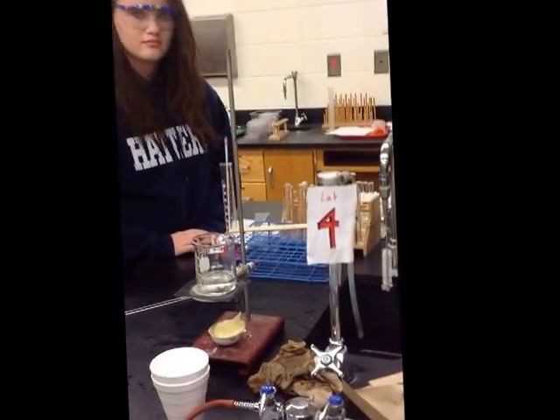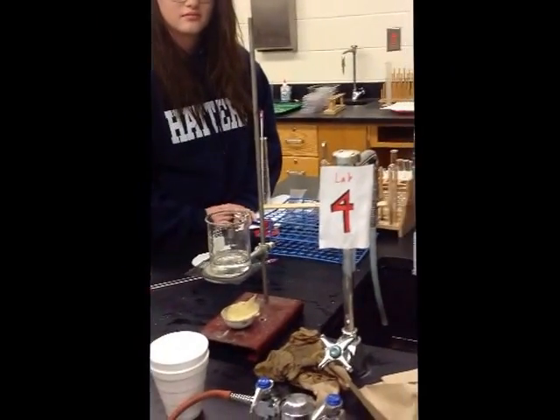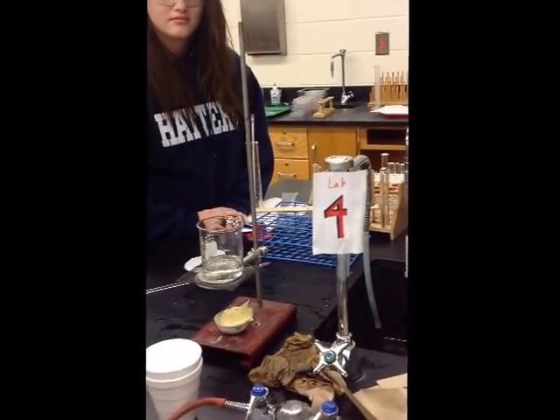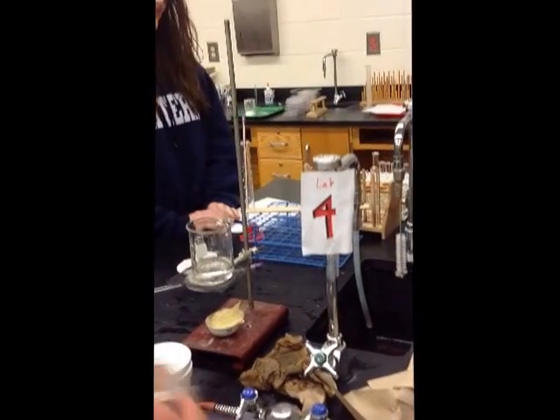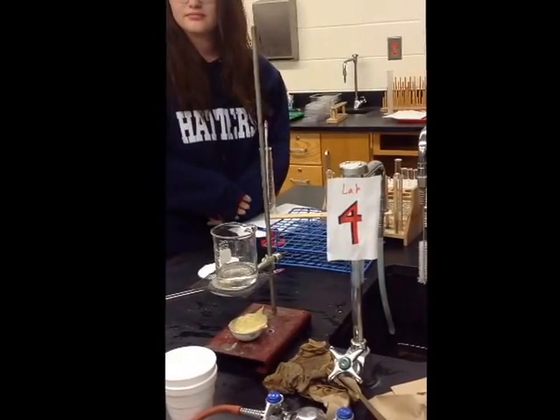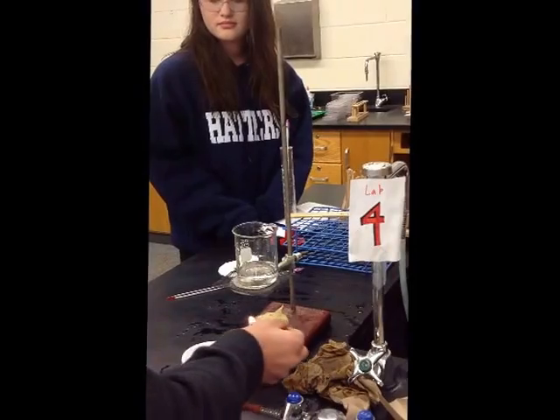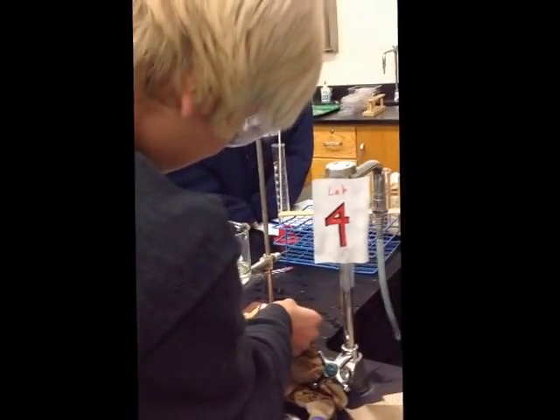Well, Brian was theorizing that if you lifted it up closer to the water, more of the heat would go into the water. Good theory, Brian. Do we have an initial temperature of the water? Yes. 20 degrees Celsius. Okay. Light it up? Yeah. So here goes Brian, our pyromaniac of the room. Better watch out and see how many matches he uses.